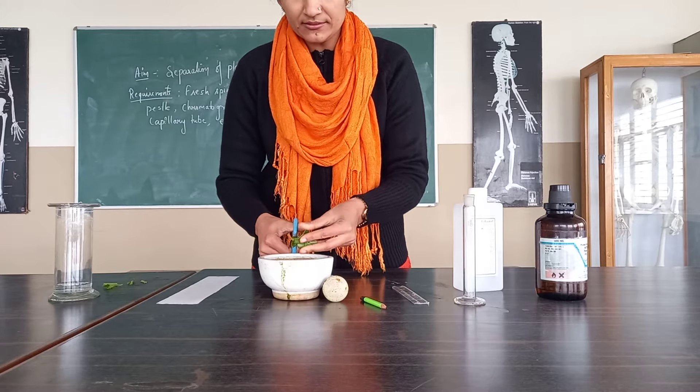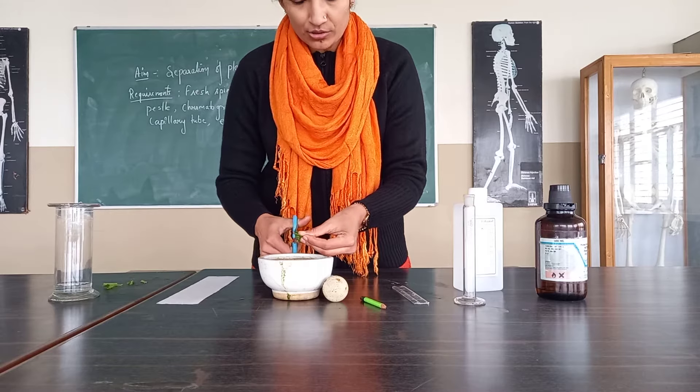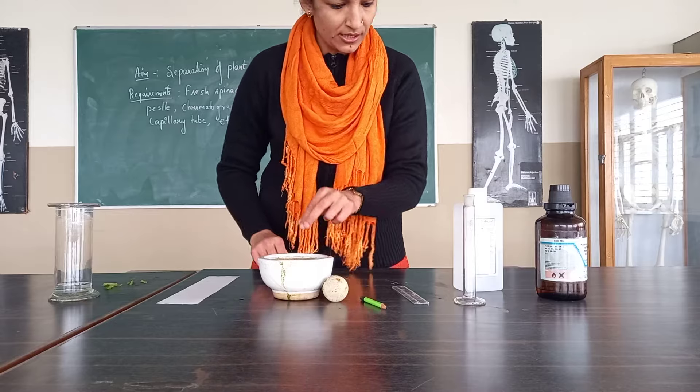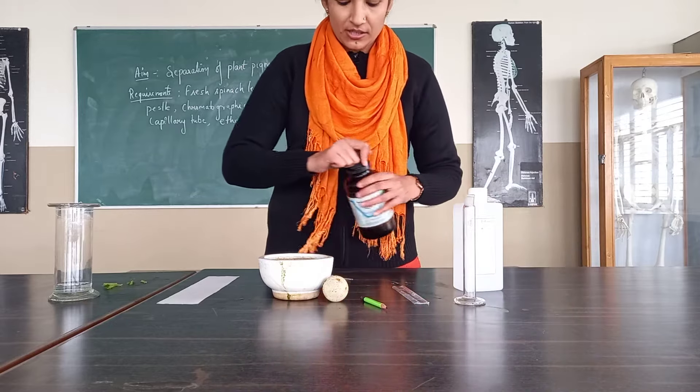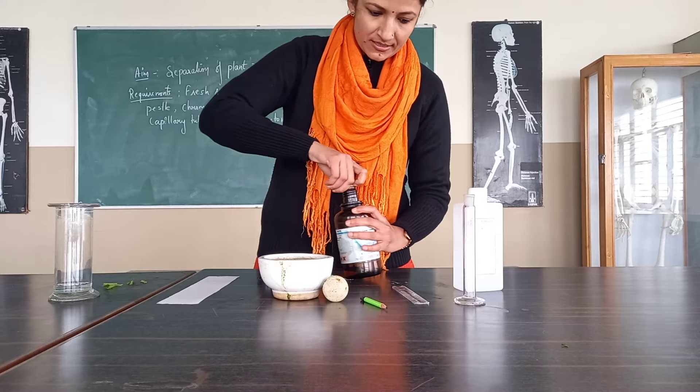After chopping, we will add the acetone. We can even use sand also for grinding — a small amount of it can be added. But we will avoid that part for now. We are going to use acetone, and we will mix the acetone in.